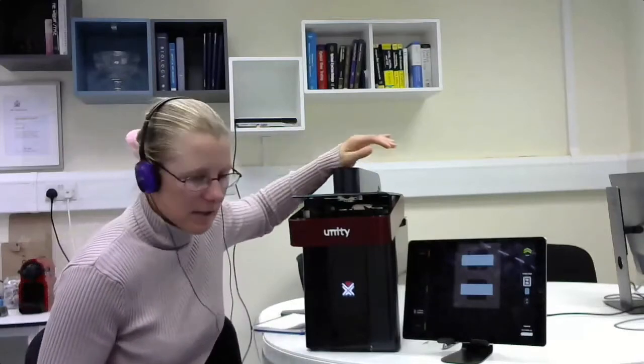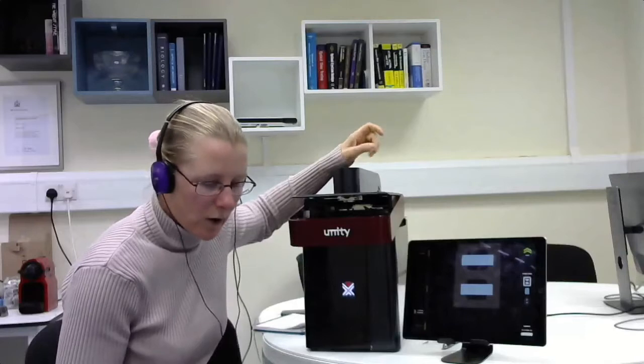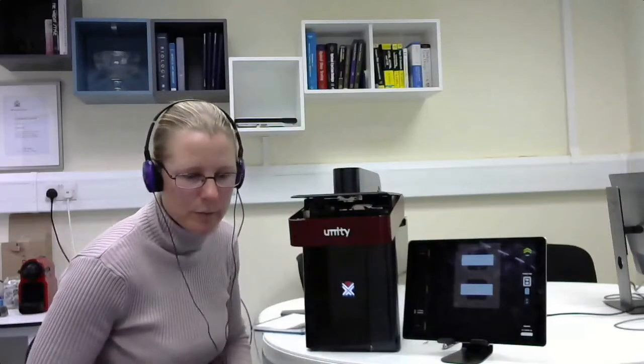So I just wanted to spend 15-20 minutes going through the Unity product that I highlighted yesterday in one of my talks. Everyone that was around at the end of the last session got a really brief overview of Unity. If anyone wants one-on-one demonstrations, feel free to contact us. We can do a demonstration for your group, or you can send us samples and we can put them onto Unity to see how it performs. Feel free to ask questions in the chat room - Remus and Lee are online to help answer questions as we go along.